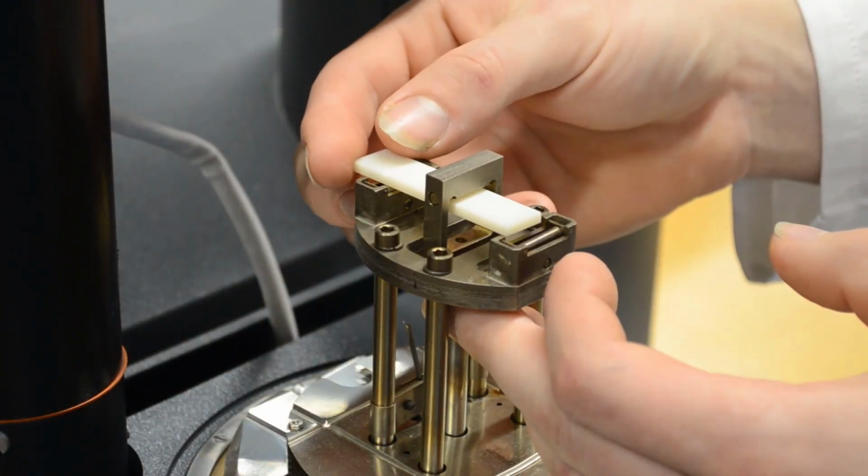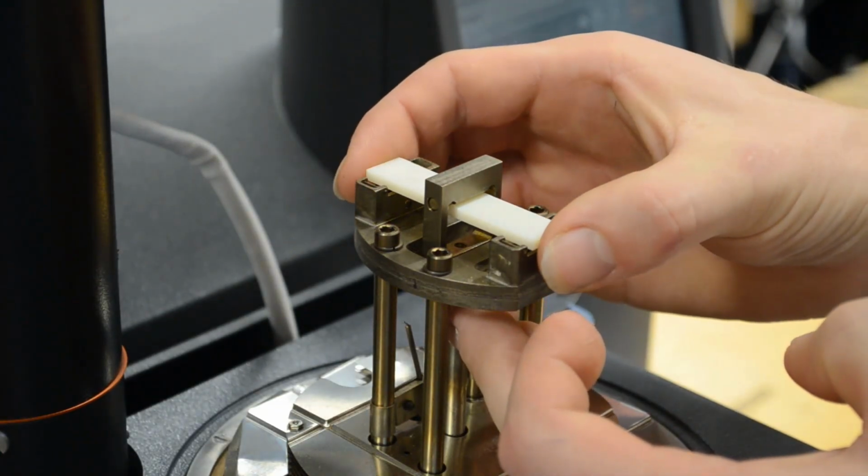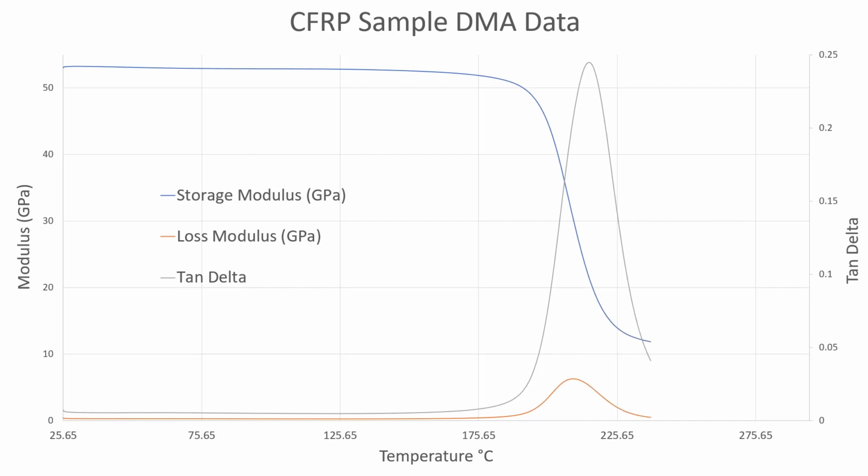A rheometer can also measure similar properties as a dynamic mechanical analyzer, or a DMA. A rheometer can be used to apply forces or displacements to a solid sample dynamically, for example with an amplitude following a sine wave pattern, to analyze the viscoelastic properties of the material at different temperatures, typically in shear.